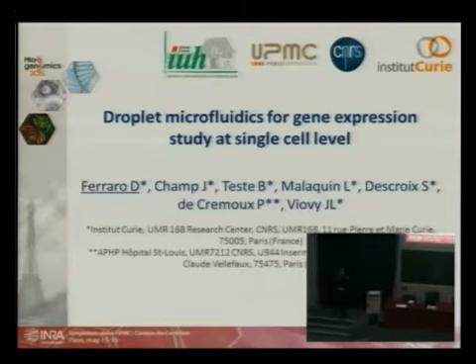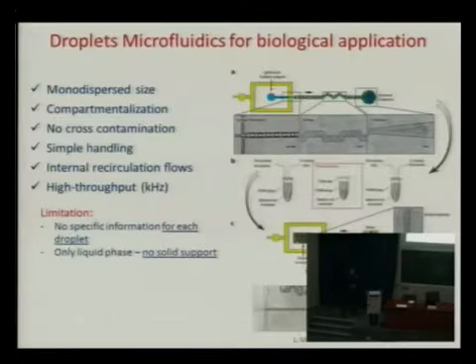So this is a first step of a work that is developed between the lab where I'm working, the Institut Curie, that is a microfluidic lab, and the diagnostic and pathological lab in the Saint Louis Hospital here in Paris. And this is about droplet microfluidics. In particular, droplet microfluidics represent one of the most promising technologies for biological application.